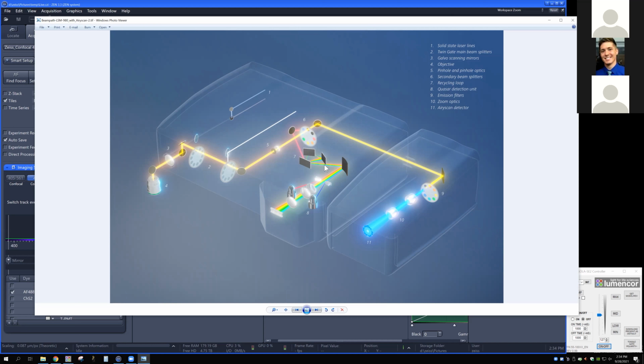But at the end of the day, for the purpose of this discussion, what these do is break up the light into its component spectra. That entire range of the electromagnetic spectrum that Cassandra showed you, from basically 400 or so out to about 750, we can separate and project across the 3 different detectors that we have. And we do this in a couple of different ways.